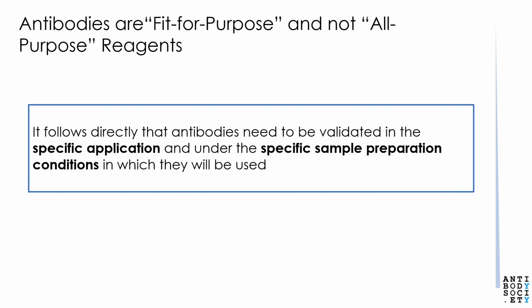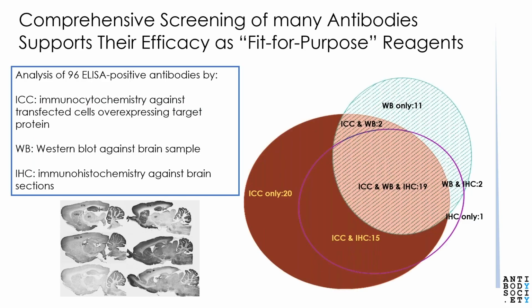This means that antibodies need to be validated in the specific applications and under the specific sample preparation conditions in which they will then be used. We have performed hundreds of monoclonal antibody projects over the last few decades, and our results consistently support that antibodies are not all-purpose reagents. Here's a summary of results from a typical project in which we validated a set of 96 ELISA-positive monoclonal antibodies in multiple applications.